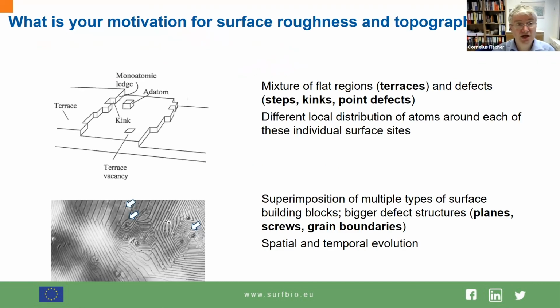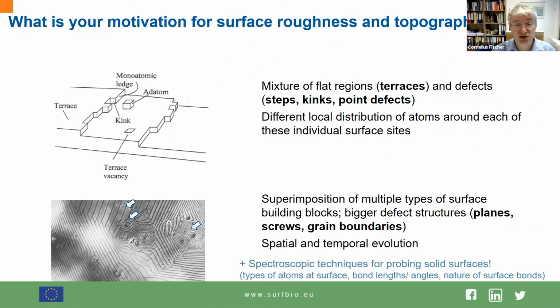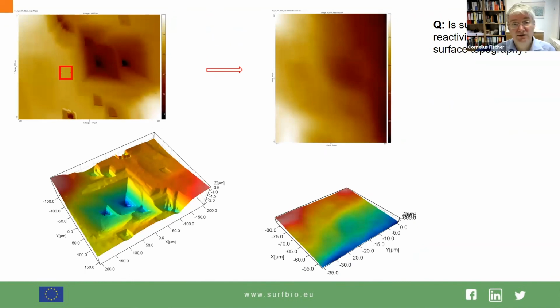So again, you have to make clear what is the basic reaction that you are going to investigate and what height range is included. So is it crystal steps, or is it another kind of defect, screw dislocations? And then you can go ahead and compare the height differences by utilizing your parameter sets of surface roughness.